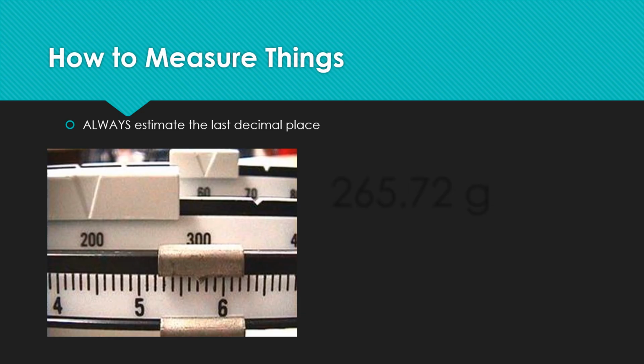So now we're going to look at taking masses. So your unit is most likely going to be in grams. So this is a triple beam balance, okay? You're going to see this when you come into class on your appropriate day. But what you have to do is actually move these to be able to make sure that it's balanced on it. I promise it will make a lot more sense when you come in, but at least you should be able to read this. That's the general idea right now.